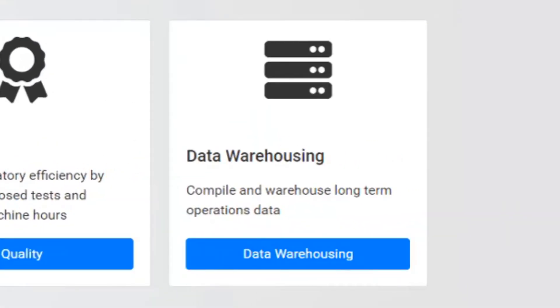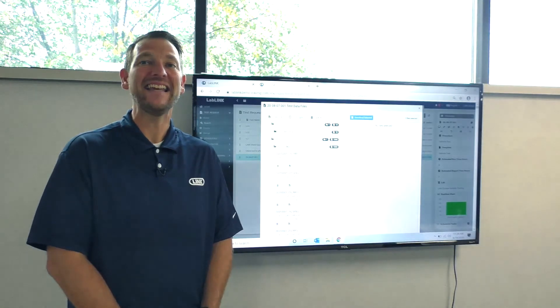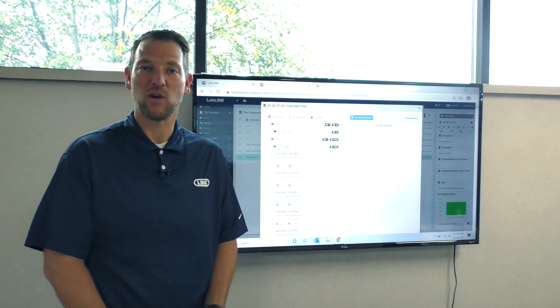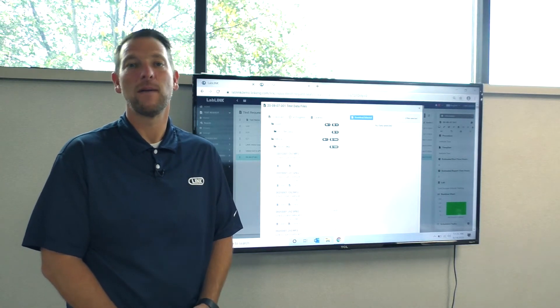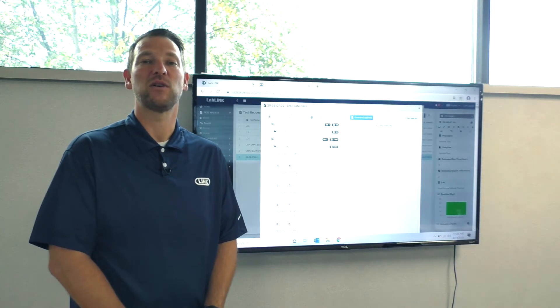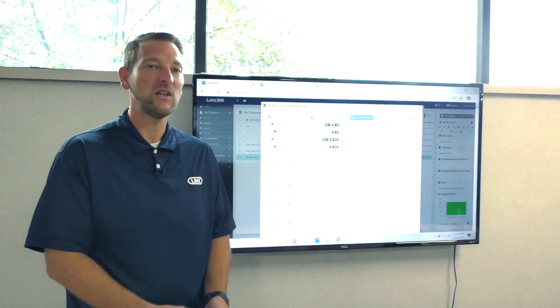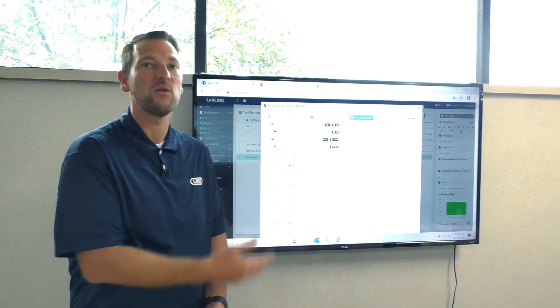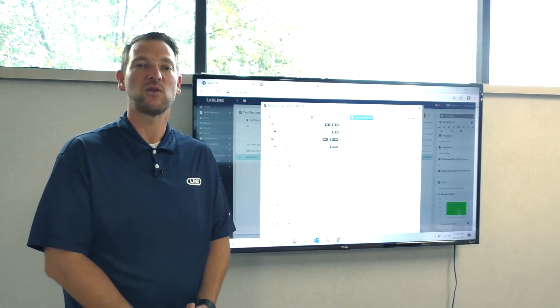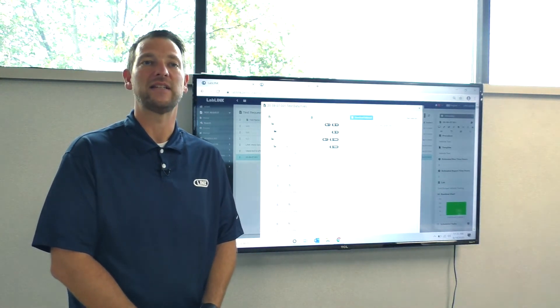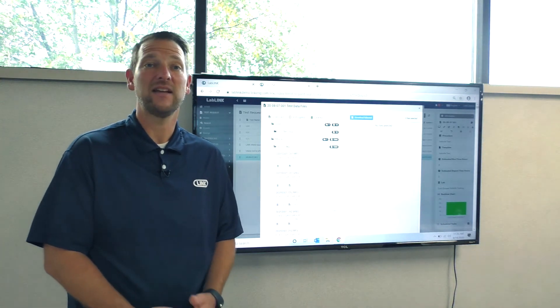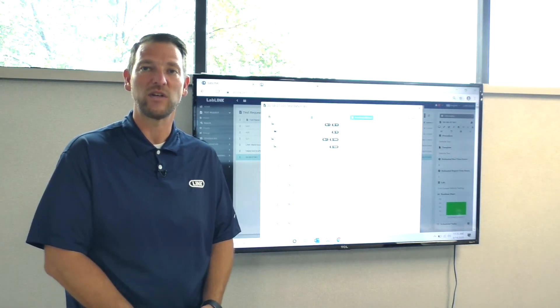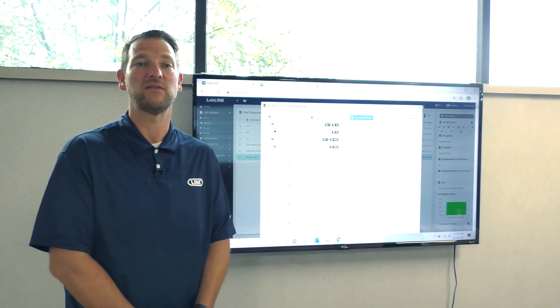In the data warehouse module, users can automatically add and attach test data to test requests, allowing things like raw data, photos, measurements, and final test reports to be stored long term. With all of your testing files attached to the test request, LabLink becomes a searchable storage library for all of your testing activities. Live data and data analytics are expected to be in place in late 2020 and 2021 respectively.